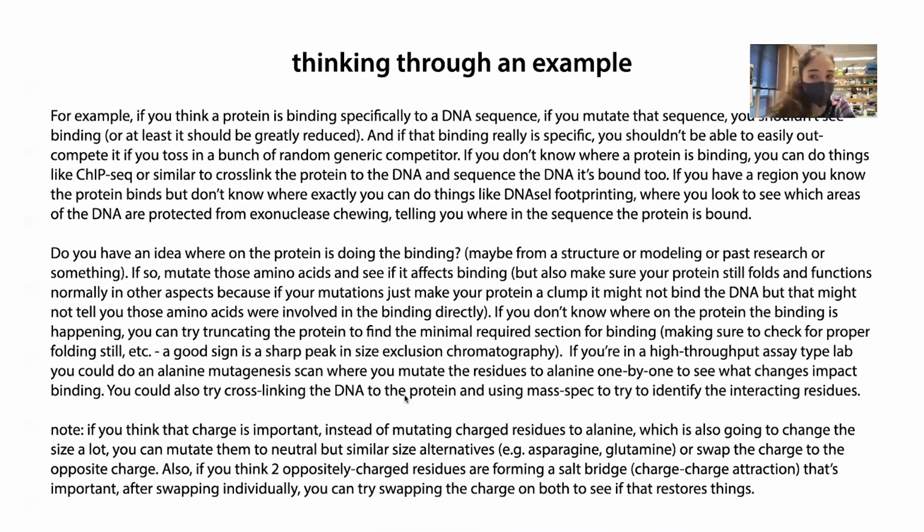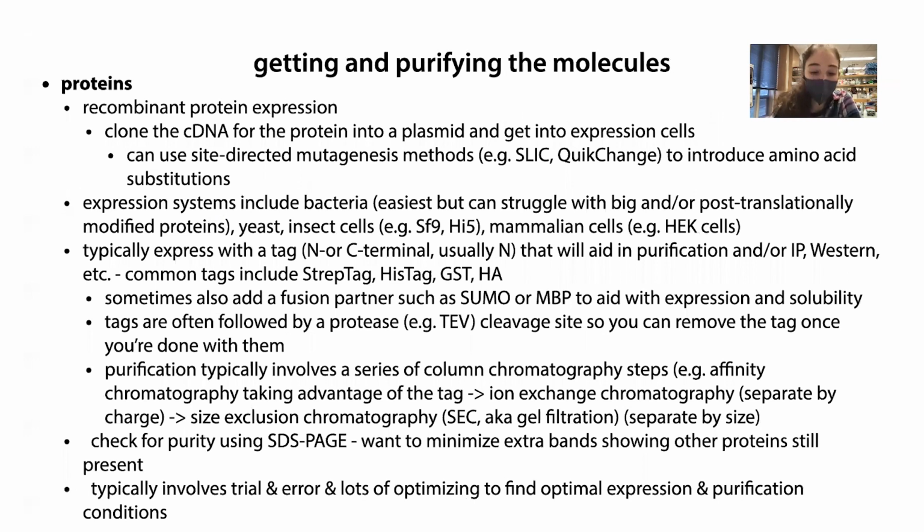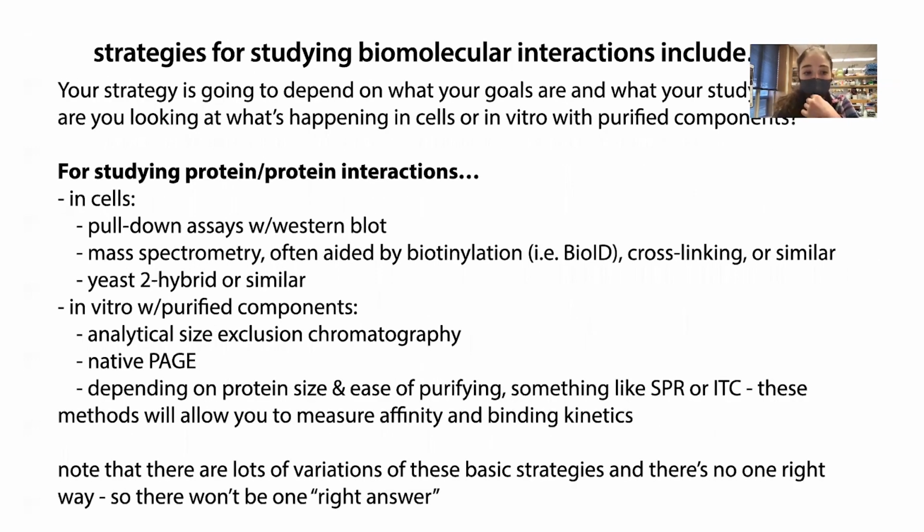And so then you can use your mutated protein and test for nucleic acid binding, or for protein-protein binding type of things. We haven't really talked about the protein-protein interaction, so let's talk some more about that. So there are a few main ways we'll do this. We talked before about how there were some biophysical techniques.